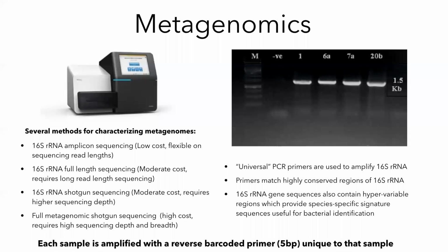If we talk about a sample coming from a human or a mammalian host, we're going to be taking a sample, and this is an easy way to separate the prokaryotes in the sample from any other type of genetic material that we have. So in a way, it is really a useful way to separate and separately look at just the prokaryotic, so only the microbial representatives, individuals in the sample.